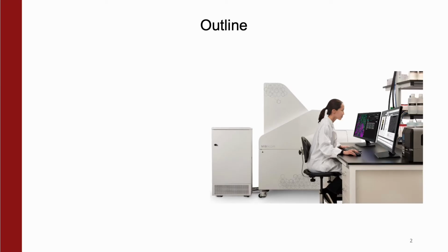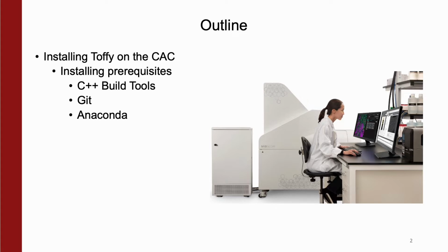To get started, we'll be installing Toffy on the CAC, but in order to do this, we need to install the following prerequisites: C++ build tools, Git, which is used to keep Toffy up to date, and Anaconda, which houses a lot of the extra libraries that Toffy uses.